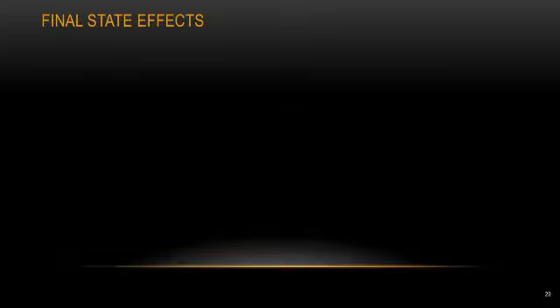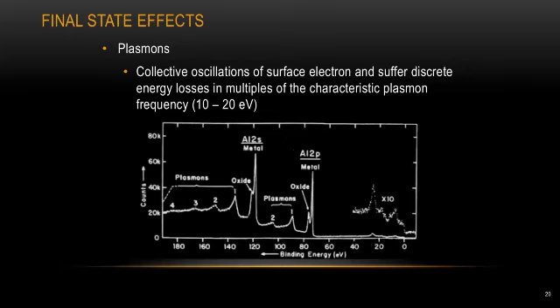And the very last component for the final state effect is called the plasmon. That is a quantized oscillation of the surface electrons, which suffer discrete energy loss in multiples of the characteristic plasmon frequency. Mostly you can only see this kind of plasmon peak on an ultra clean metallic surface such as magnesium or aluminum. The data on the screen is the aluminum 2s peak and 2p peak. Next to these two main peaks, we also see a few tiny peaks. Those are plasmon peaks. And for the case of aluminum, the separation between the plasmon peaks is about 15 eV.